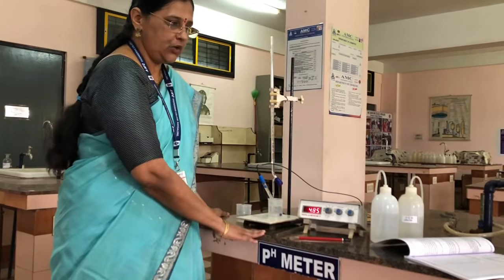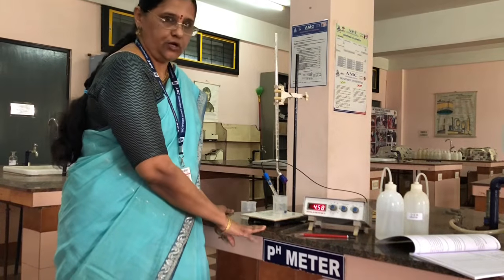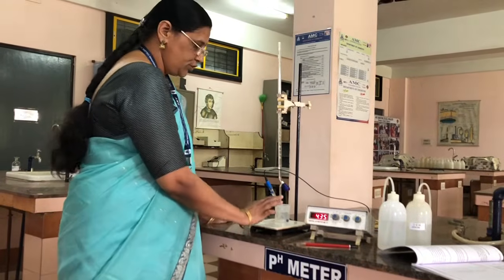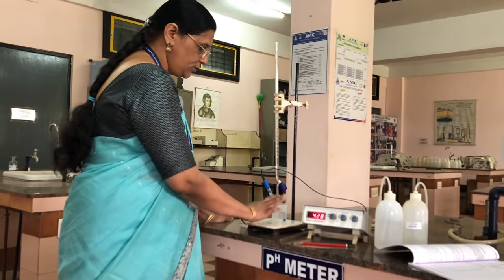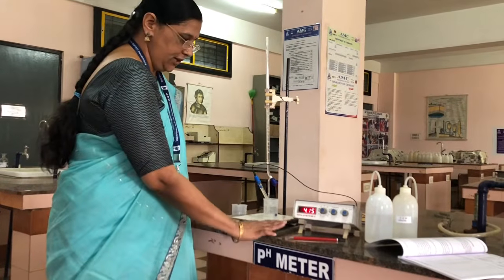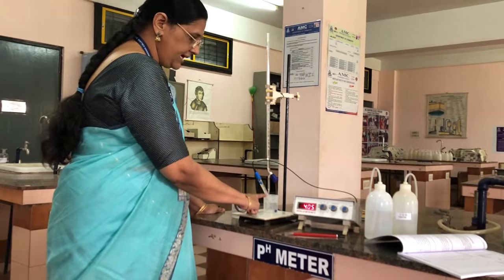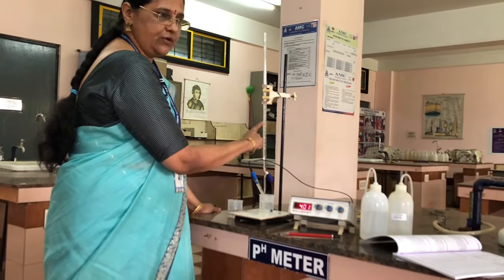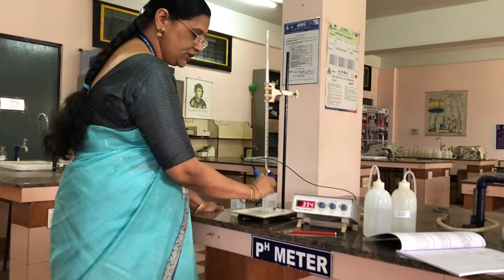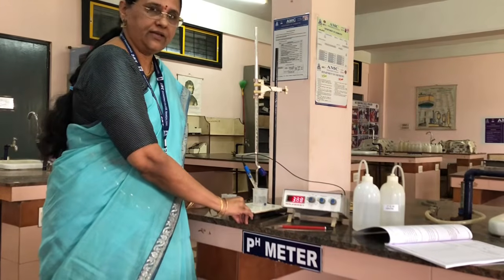In the second video, I will explain to you how to do the calculation part. I hope all of you have understood how to do the experiment. Only thing is, you should be very careful with the instrument, with the electrodes we are using. So for pH meter, you have to remember that we are using a combined glass electrode, taking weak acid in the beaker, taking sodium hydroxide in the burette, adding in 0.5 ml increments, shaking the solution, and noting down the pH of the solution. I hope all of you have understood.